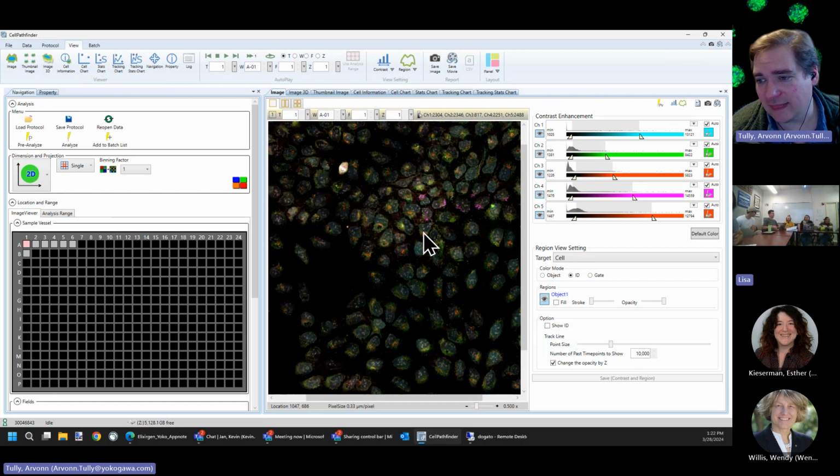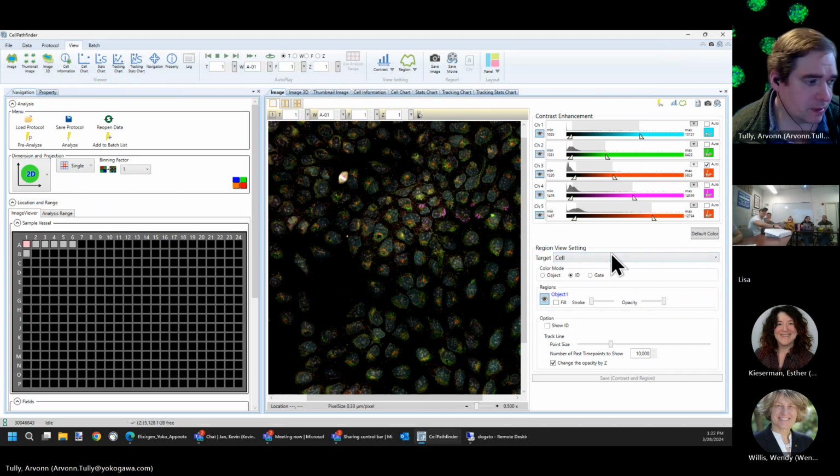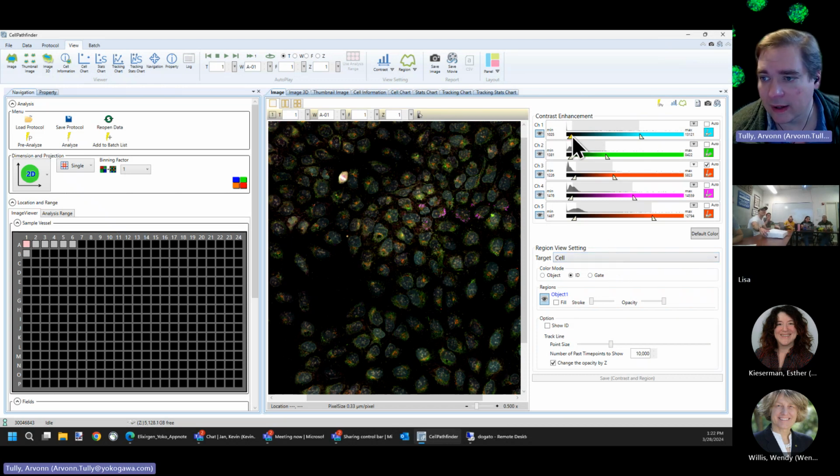So this is pretty important. The other thing I like to tell people is to watch out for automatic, because automatic will frequently hone in on maybe the wrong thing. So you have to be very careful. Sometimes what you think is good is not really good. You have to actually look at the real numbers in the data. So you just have to be really, really aware of what's going on.